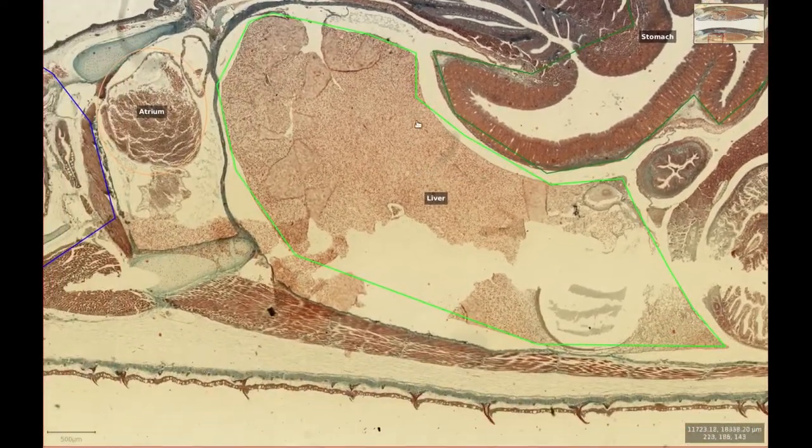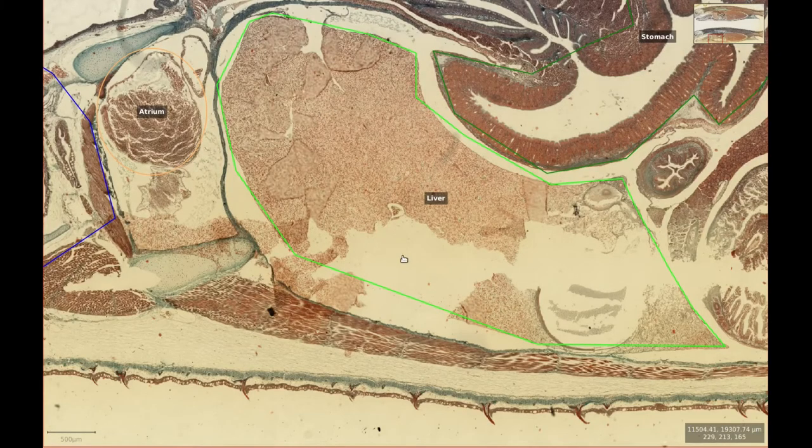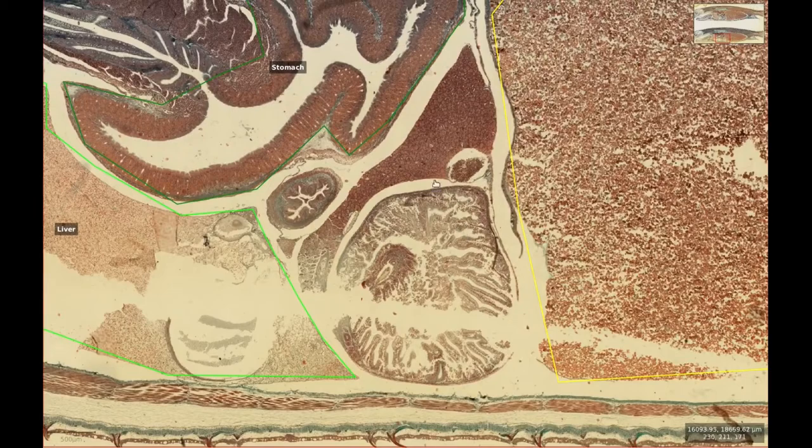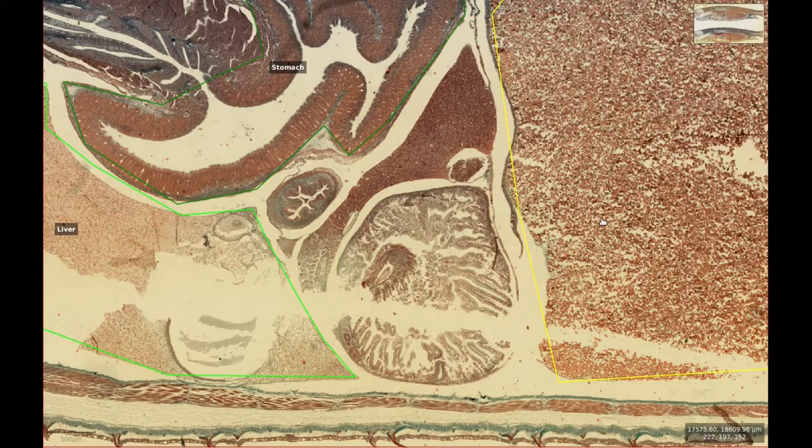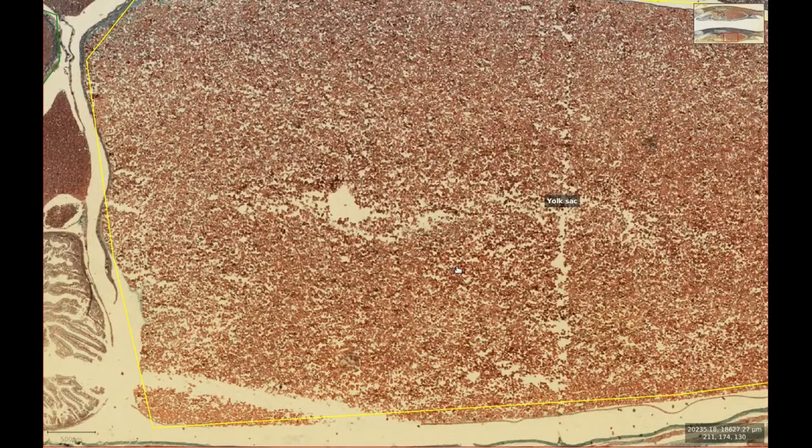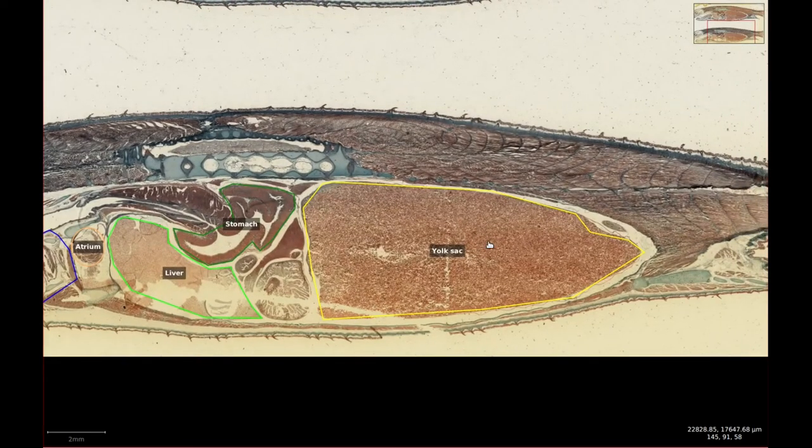Surrounding the stomach again is the liver, and caudal to all of that we have more sections of intestine and the yolk sac there again, dominating most of the coelomic cavity.